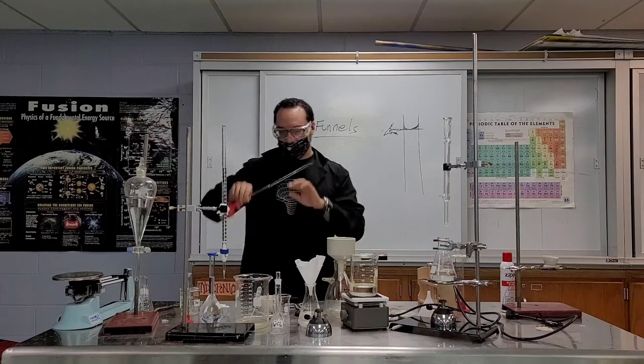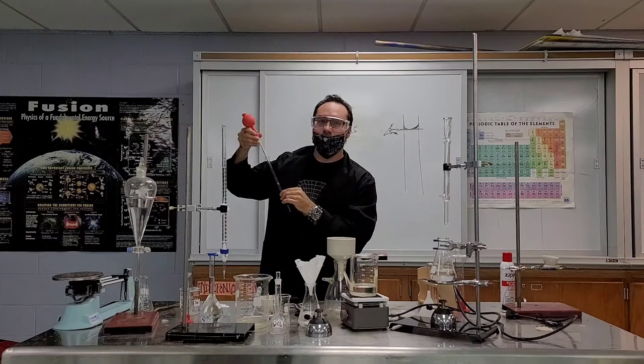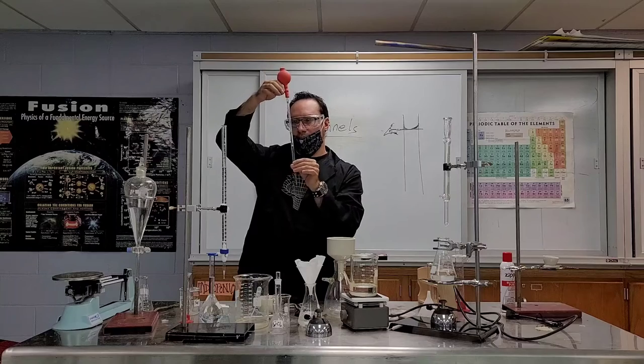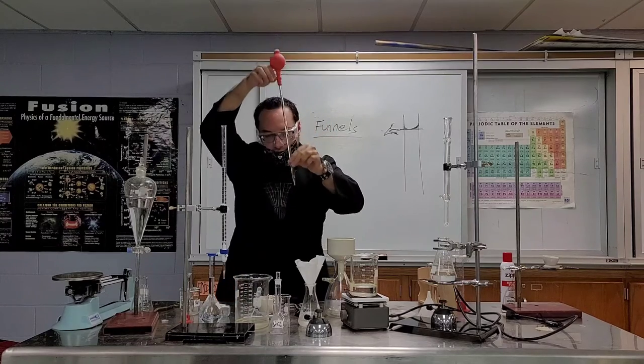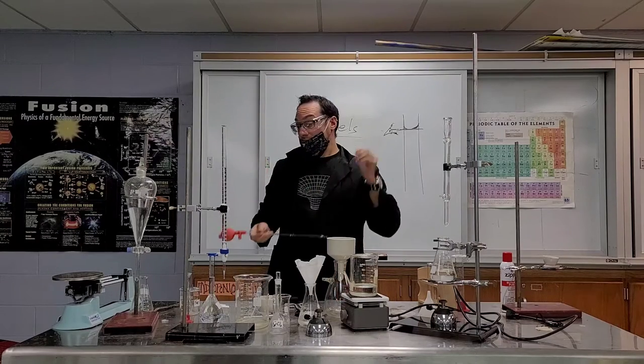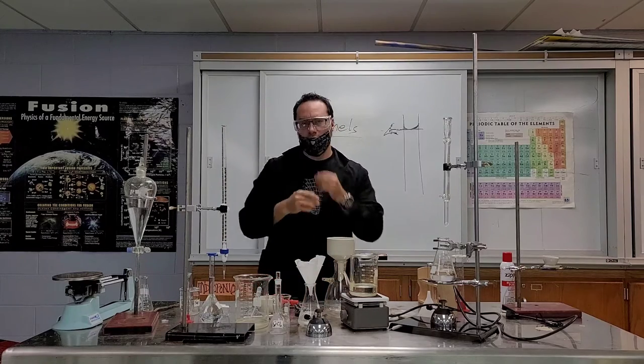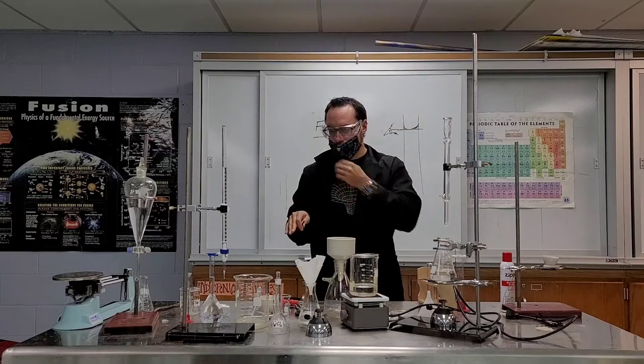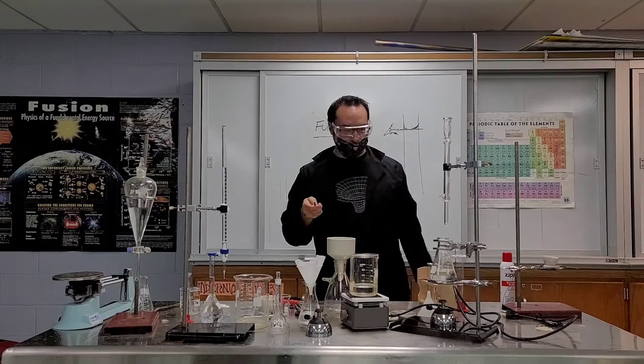All right, there you go. That's most of the equipment we'll be using. There's some other stuff and I'll introduce it to you. Like this guy, oh, this poor dude I didn't introduce, and it's not on your paper so don't worry about it. This is a volumetric pipette. It's got lines on it and lets you carefully measure a certain amount of stuff you want to add, but it's not even on your lab paper so don't worry about it. Maybe we'll use it at some point. Next time I see you guys and girls, we'll go over a little bit of safety in depth. All right, thank you. Later.